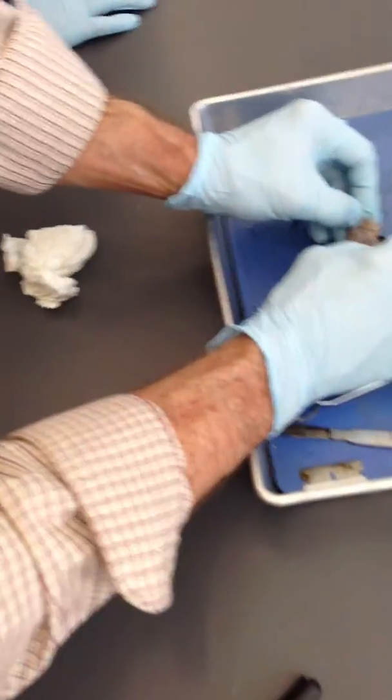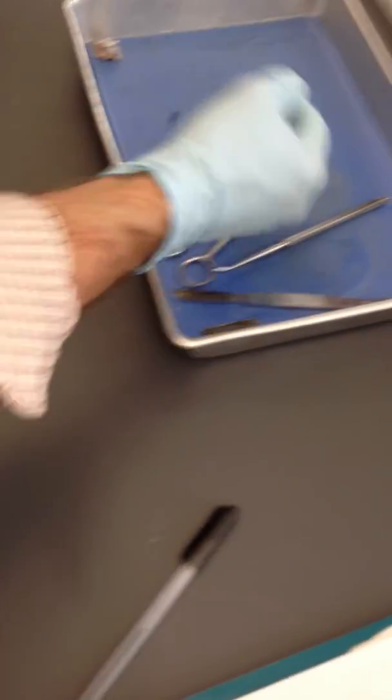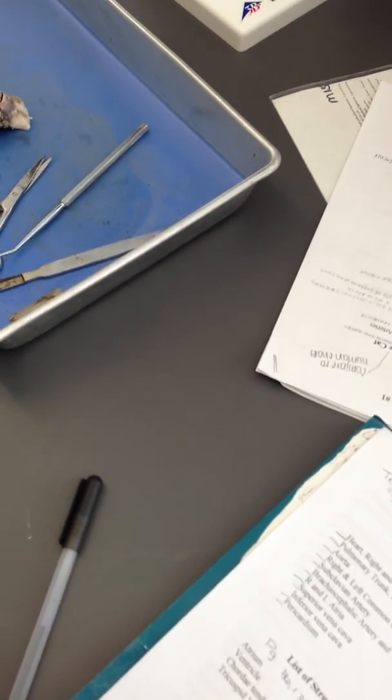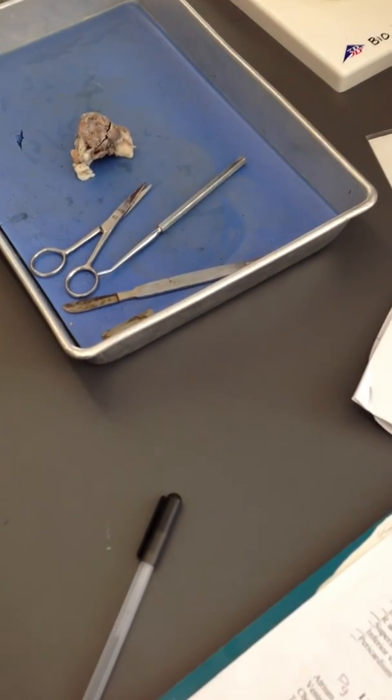So now, at some point I'm going to circulate around to others, but if you want to pop that lens out of its location, you'll see the hole, the pupil, which is surrounded by the iris around that, so you can poke around there.